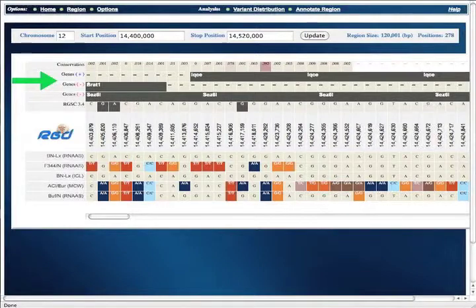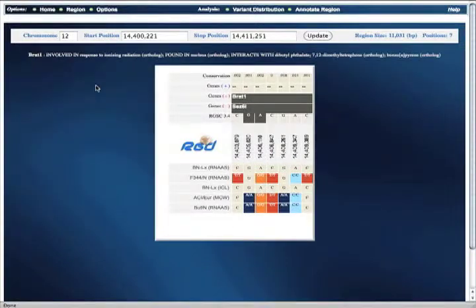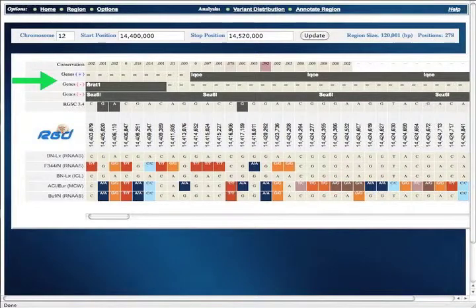The genes are displayed as shaded boxes on the tracks, which are sized according to the number of SNVs. This particular region has 2 overlapping genes on the minus strand. If the box is too small to display the entire gene symbol, you can mouse over it in order to display the symbol. Selecting a gene will reset the region to that gene's start and stop position. It will also show the gene description. Gene descriptions are automatically derived from RGD's ontology annotation. The gene track for the minus strand works in the same way as the track for the plus strand.